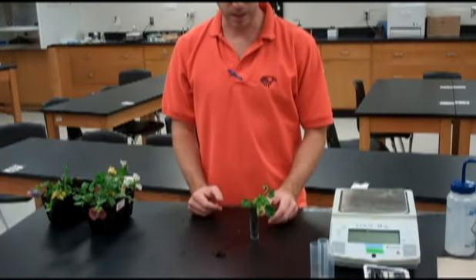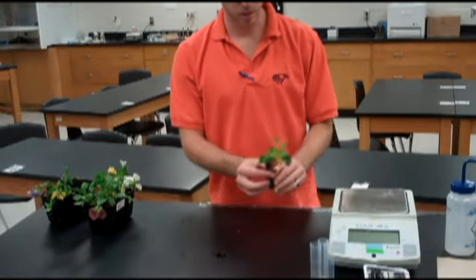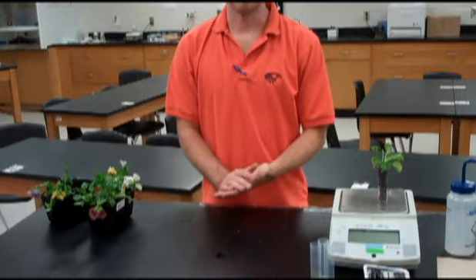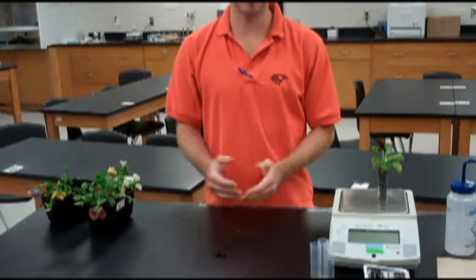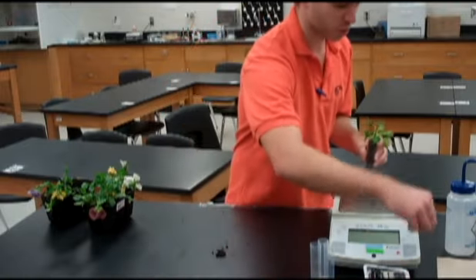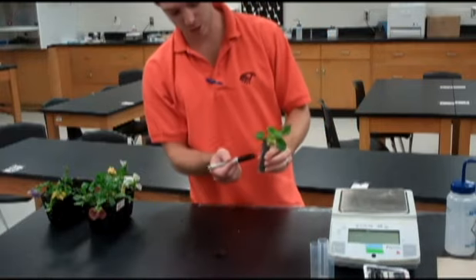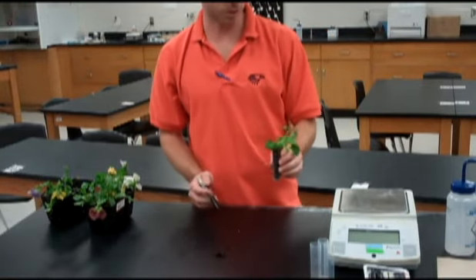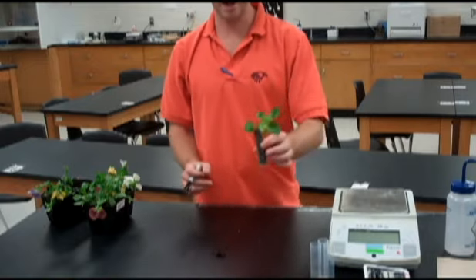Once you have it sealed and set up, it's time to mass it. Take your balance and don't forget to zero it. Once it's at zero, mass it to find your total initial mass. Use a sharpie to get your mass written directly on the tube along with the label for what condition you're running. Label the initial mass and now you're ready to let it sit.